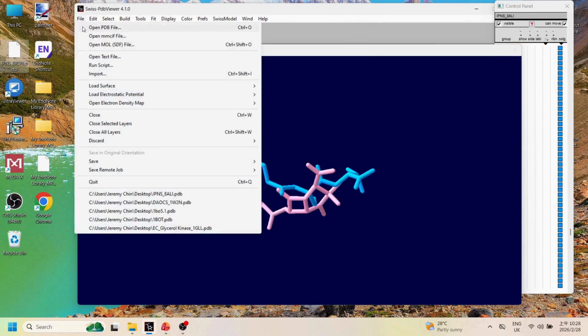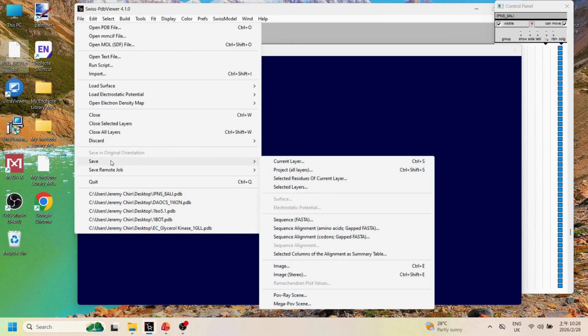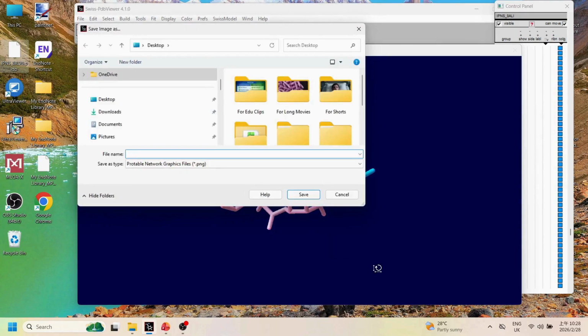And that's it. You've successfully aligned proteins, analyzed key features, and prepared your results using Swiss-PdbViewer. This tutorial demonstrates a more advanced technique built upon the foundational methods you learned in earlier videos.